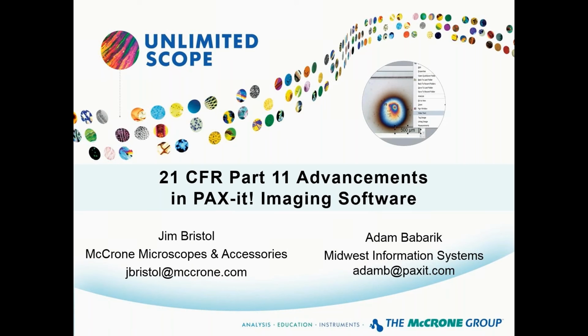Before we get started, I would like to tell you a little bit about Jim and Adam's background and experience. Jim is a technical sales representative for McCrone Microscopes and Accessories with more than 30 years of experience in optical instrumentation and software sales. Jim has successfully sold and supported complex imaging systems such as laser scanning and spinning disc confocal microscopes, integrated systems for cell stereology and neuron tracing, as well as scanning electron microscopes and thermal microscope systems.